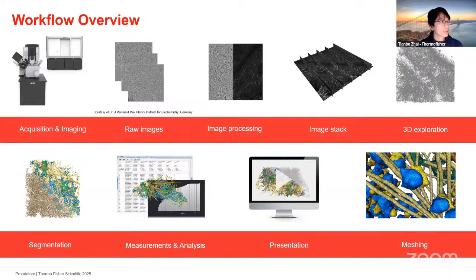But again, to emphasize, when you try to initiate an image analysis, in this context, CryoET is one of those popular topics right now.